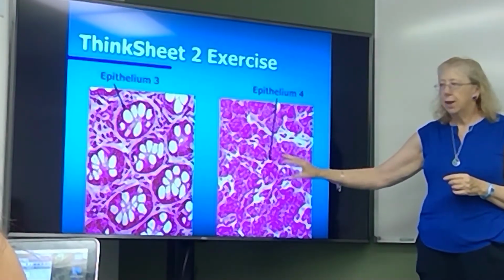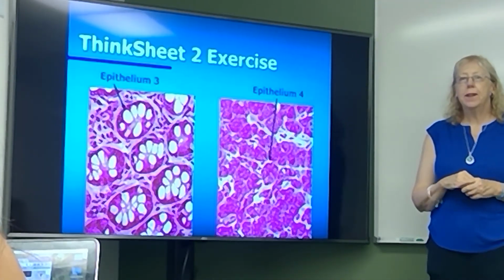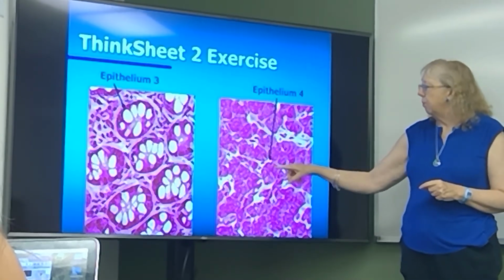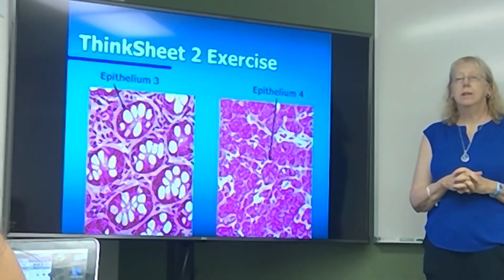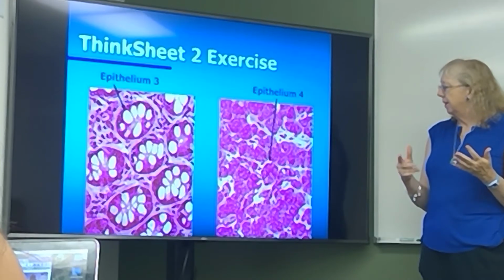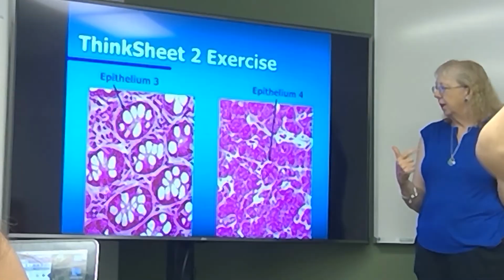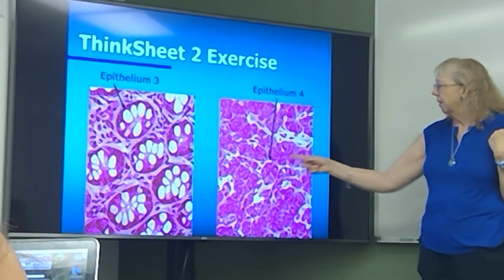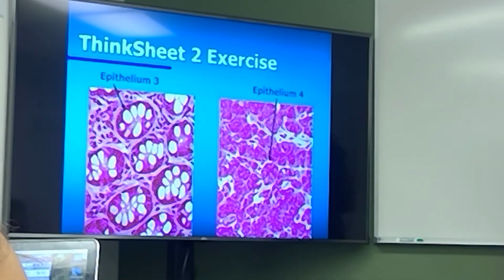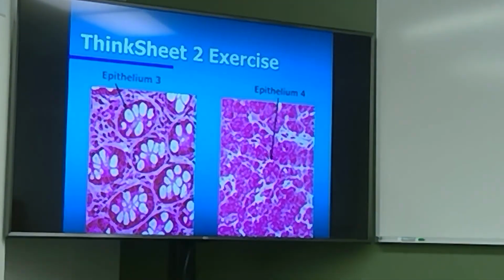This is from the pancreas. And we have acini, or clusters of cells that surround the ends of ducts in the pancreas, and they are all busy producing enzymes, especially, insulin? No, trypsin, chymotrypsin. So, yes. They're in little membrane-bound vesicles, and that's why they appear as little pink dots there. Okay. So that's all I have for you today, and I'll see you tomorrow.